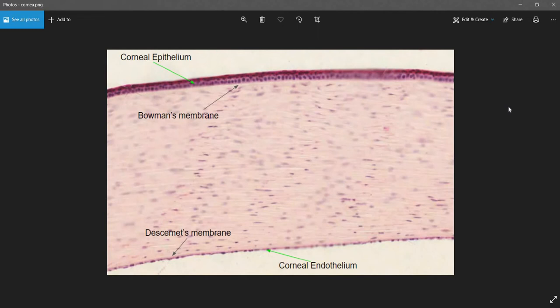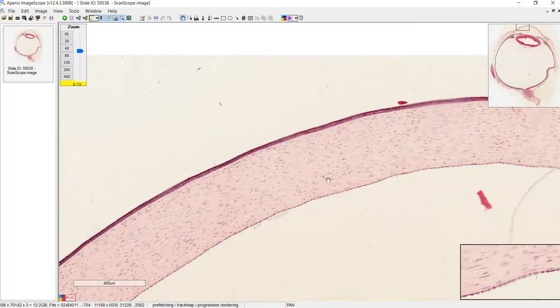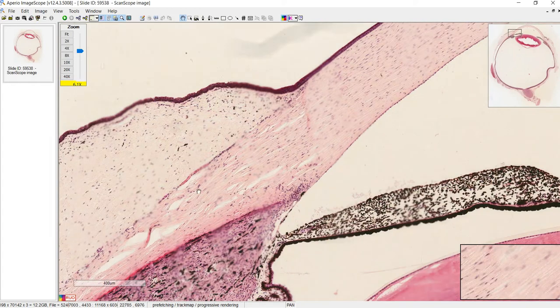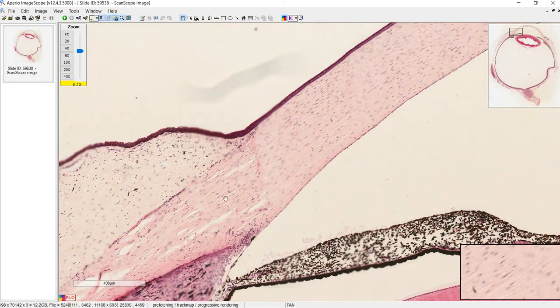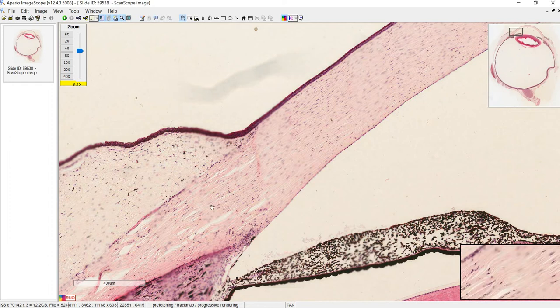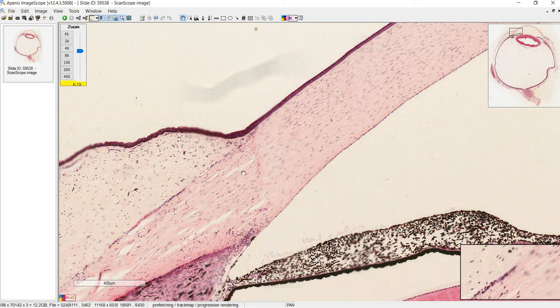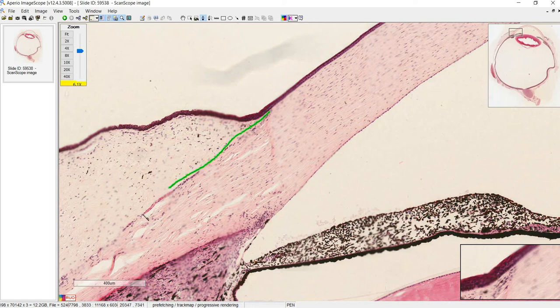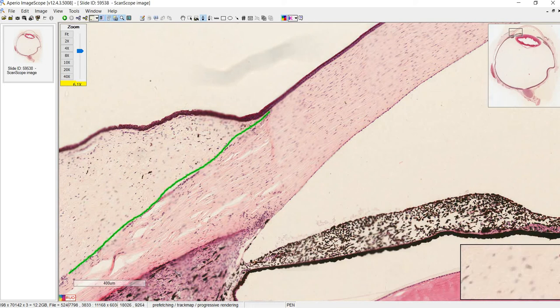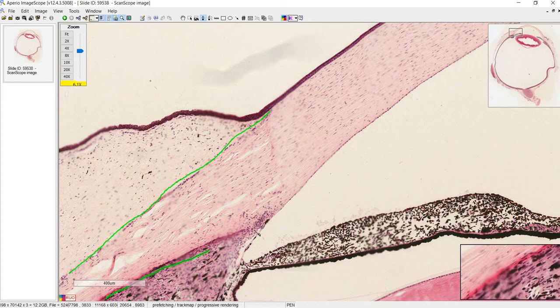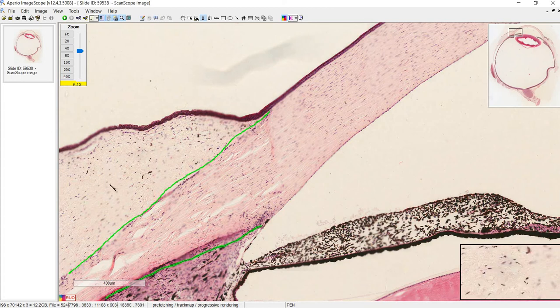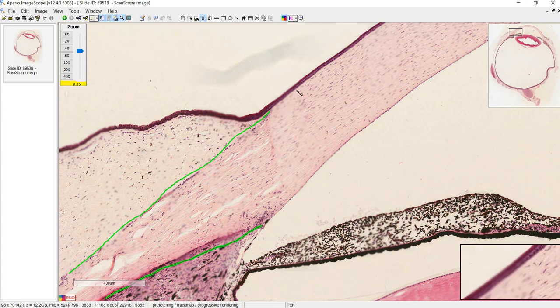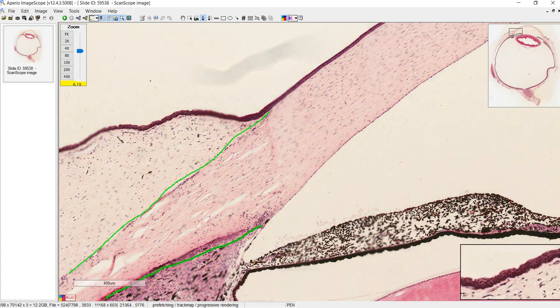Here's a labeled slide so you can see the spellings. Now if we follow the cornea back, we can see the sclera — it's continuous with the cornea and made of a similar material, also lots of collagen. The sclera is what people refer to as the white of the eye. Superficial to the sclera there's another layer of material — this is the conjunctiva, made up of fat and connective tissue. You can see that the stratified squamous corneal epithelium is continuous with it.